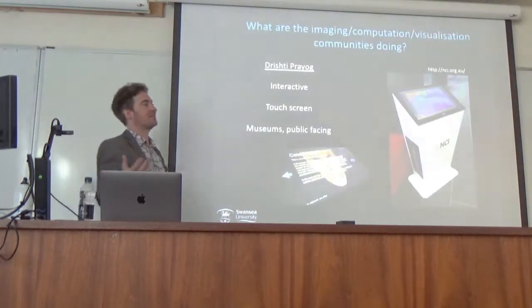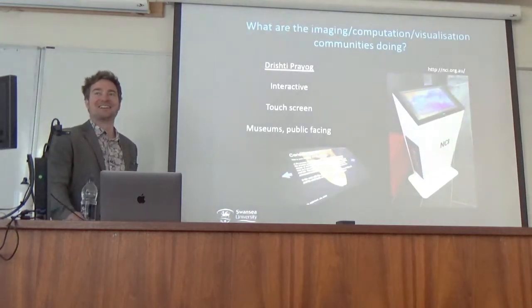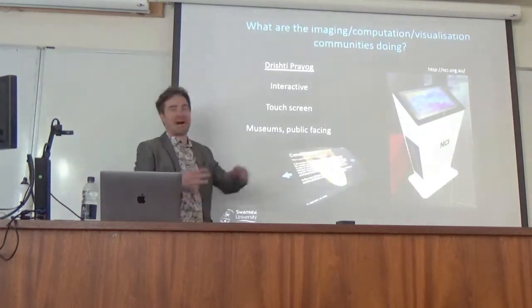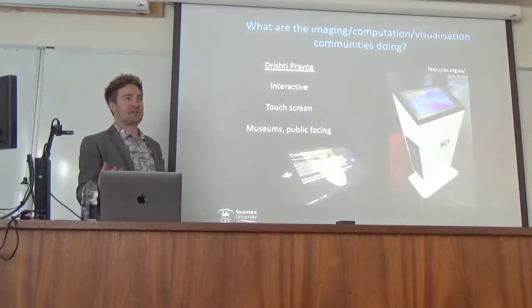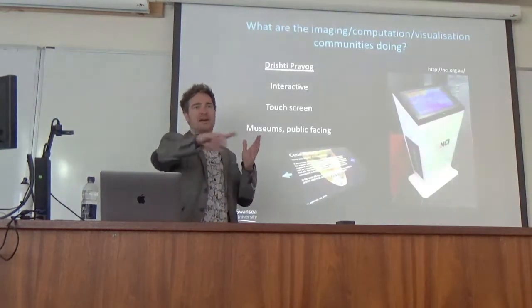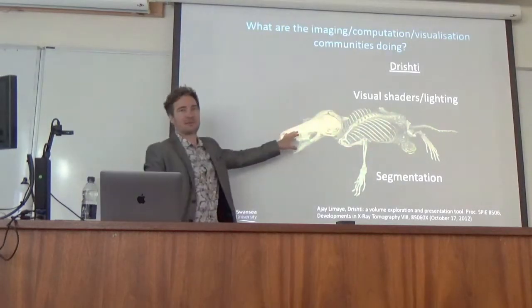So anyone who hasn't worked on that data can come and play with that data without changing anything, but also it's a communication tool. So you can give a background to the data, and then you move into it, and with the touchscreen it allows people to remove, like that example that I just showed of the shrew. That's not what the specimen looked like when I scanned it.